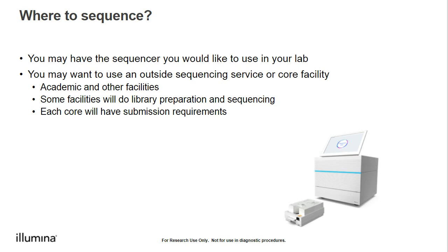You may instead want to use a sequencing service or core facility. These facilities may be academic or non-academic providers, and each facility will have information on how to submit samples for sequencing. Many core facilities also offer library preparation services.